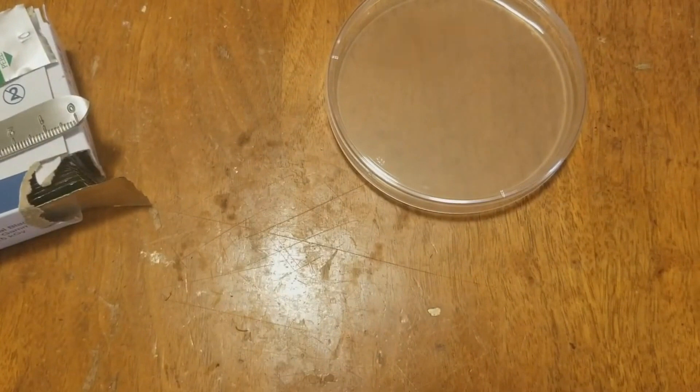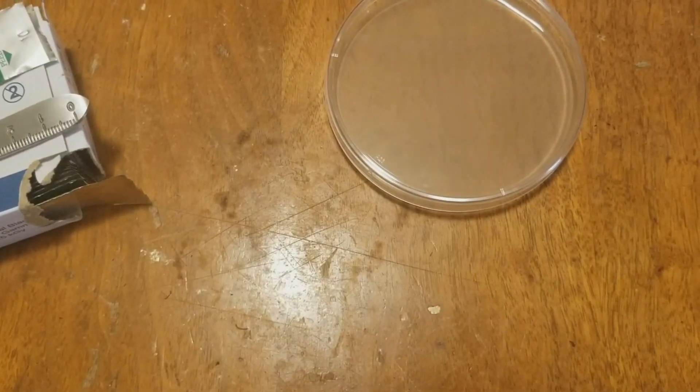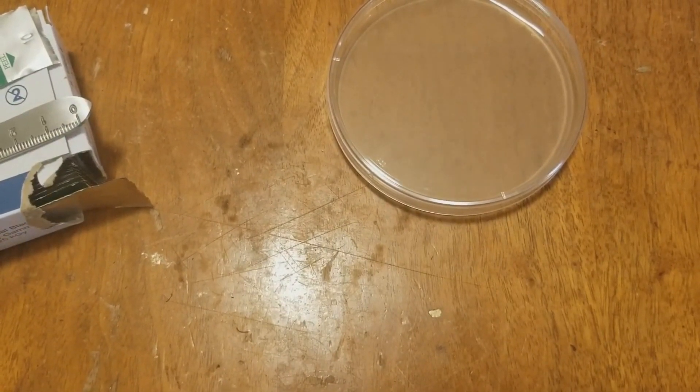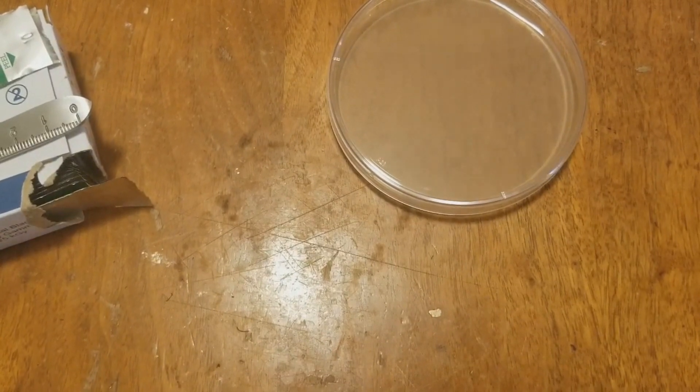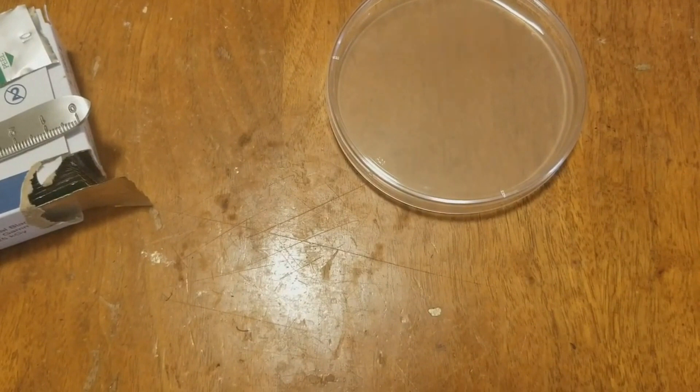You're going to need some mushrooms. I've got some dried mushrooms here and we're going to go ahead and make a culture. I've already sterilized my hands — I don't have any gloves today. Since I have to touch everything, I might as well go ahead and re-sterilize my hands.